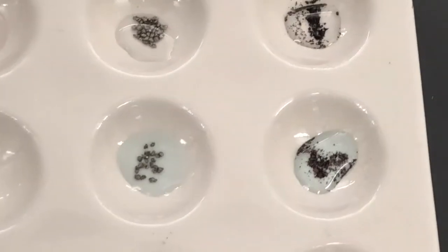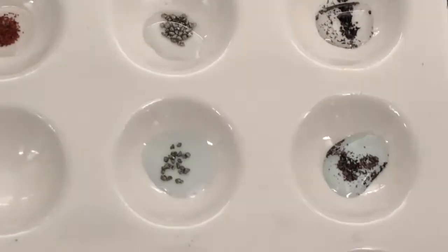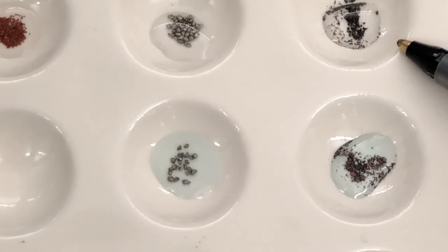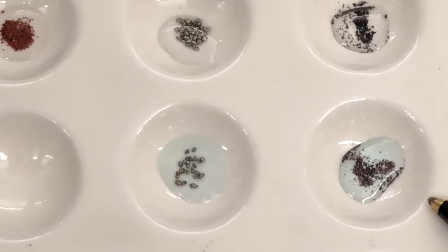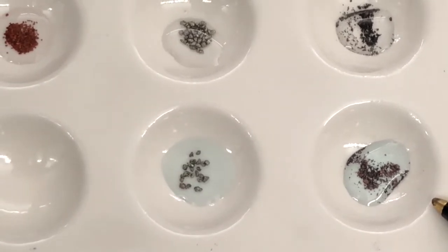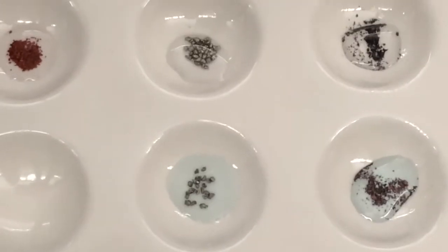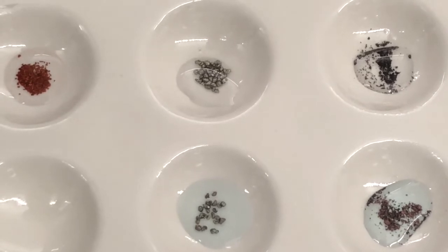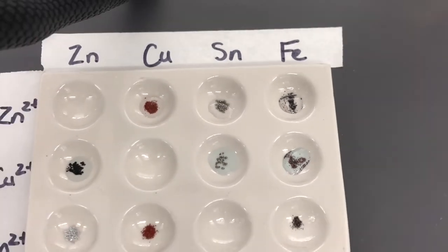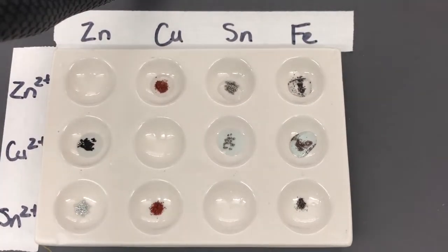In this particular situation, I'm starting to see a difference in color. So if you compare the color of the iron when we added zinc 2 plus to it versus the color of the iron when we added copper 2 plus to it, you'll notice that this is not the difference in the camera lens. You're actually starting to see some of that copper color precipitate out. That's a suggestion that the copper 2 plus is reacting with the iron. All right, now that we caught that reaction taking place, we can move forward with our tin 2 plus.